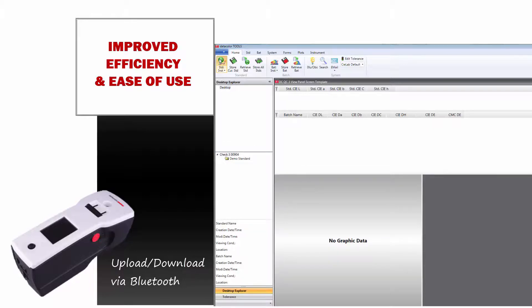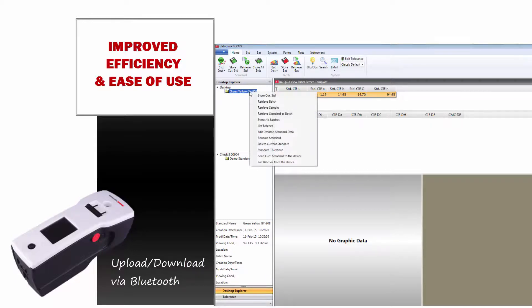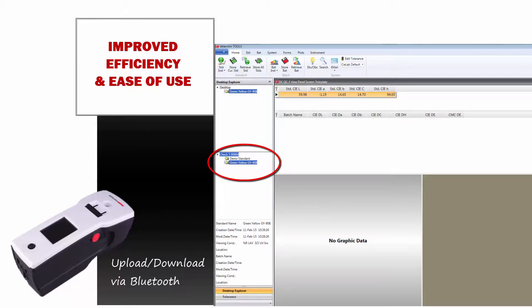The procedure to upload and download data is simple and typically includes these steps. Right-click on the measured standard and select 'Send Current Standard to Device' or use the appropriate button on the instrument toolbar. Notice that the green standard is now on the CHECK-3 desktop, meaning the standard has been successfully transferred to the unit. On standalone mode, measure a few batches against the green standard. Right-click on the CHECK-3 and select Refresh — the green standard now has three batches. From the Tools desktop, right-click on the green standard and select 'Get Batches from the device.'